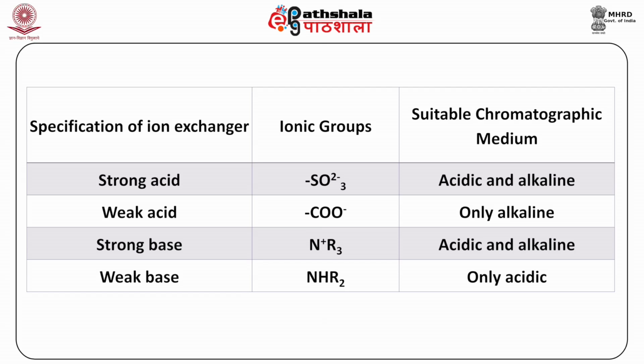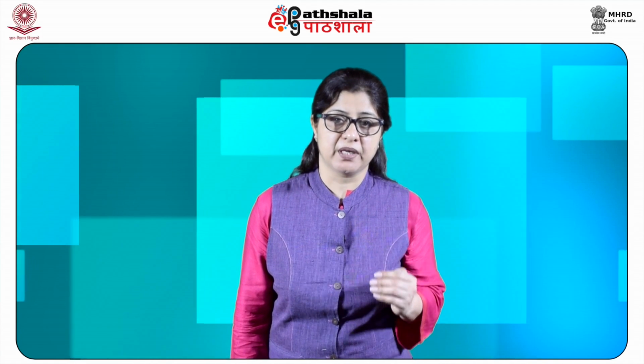Furthermore, the others have been described. For practical use, the dissolved material must be present also in the dissociated form if it is to be retained by the resin. It is most convenient to work at a pH where one of the components will be retained, while the other does not interact with the ion exchanger.